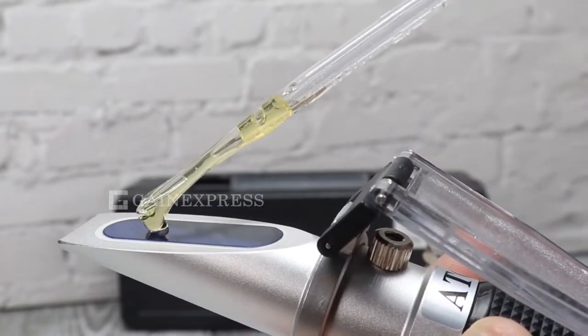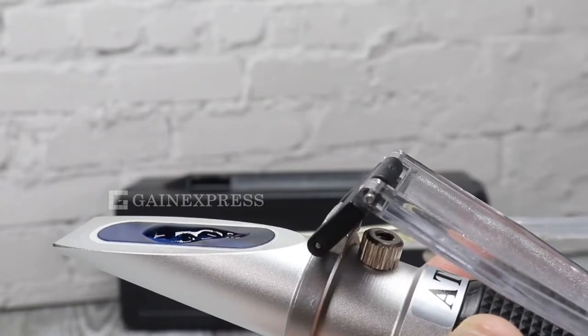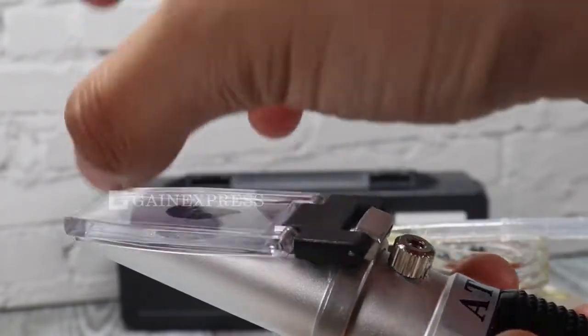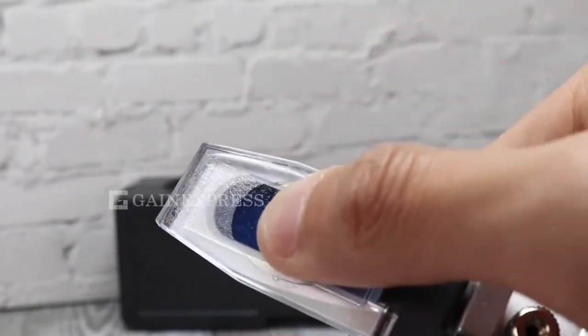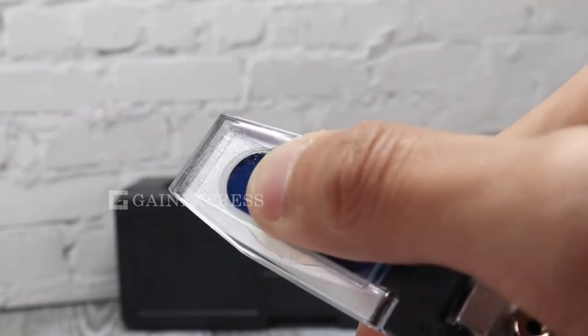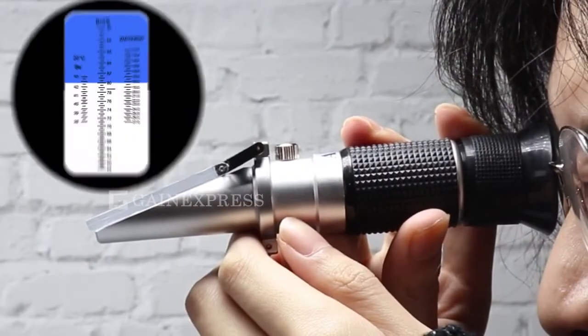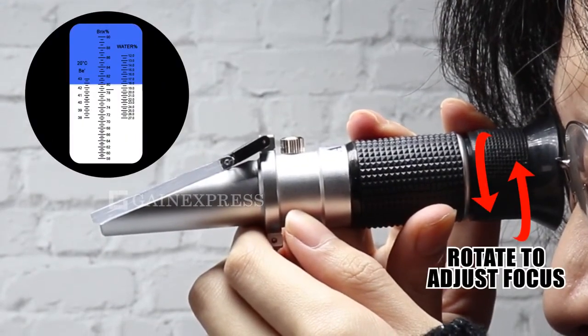Place a few drops of sample on the main prism and close the daylight plate. Make sure the sample is evenly distributed with no air bubbles on the prism. Aim the front end of the refractometer in the direction of light.